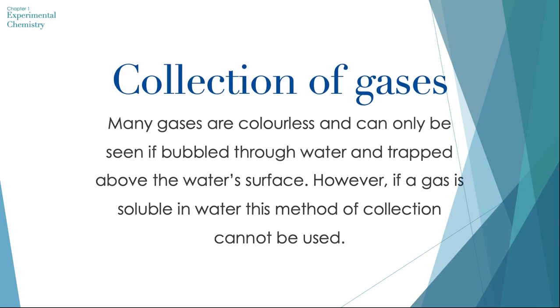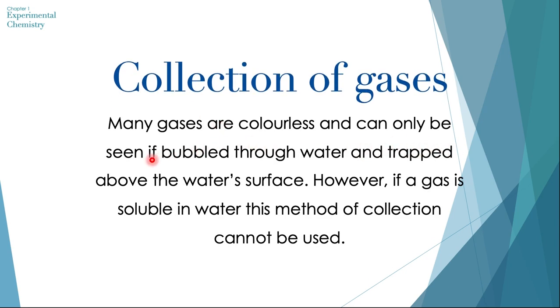So many gases are colorless and can only be seen if bubbled through water and trapped above the water's surface. However, if a gas is soluble in water, this method of collection cannot be used, okay? Because it will simply just get absorbed in the water. No bubbles will be formed. If it's insoluble, only then the bubbles will form.